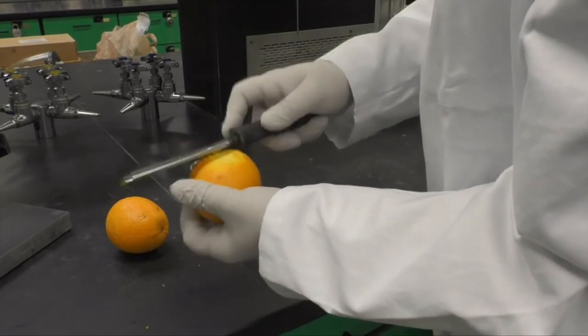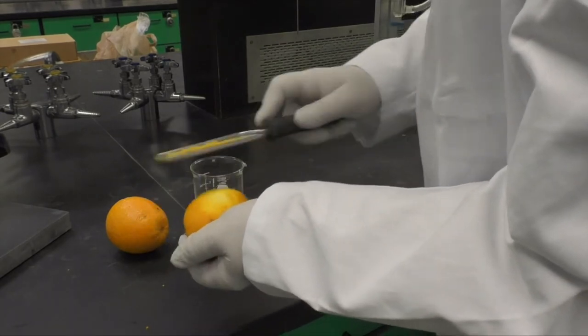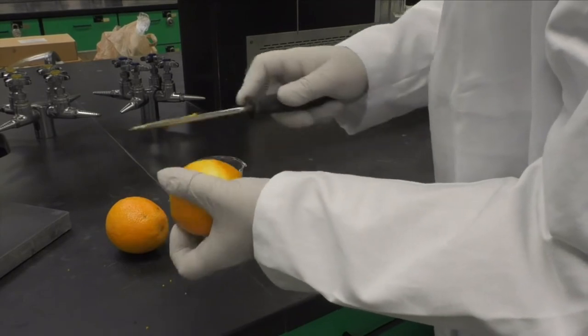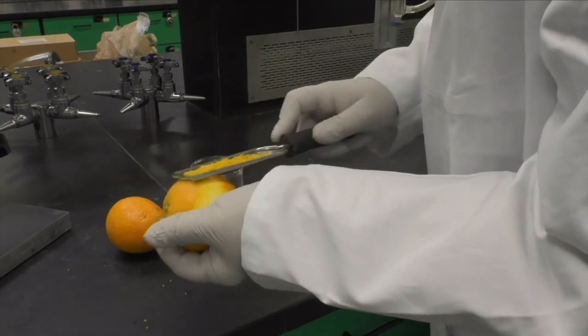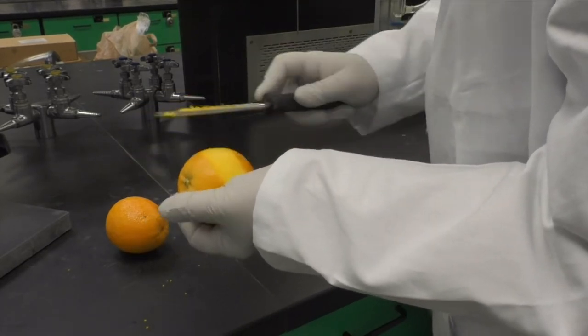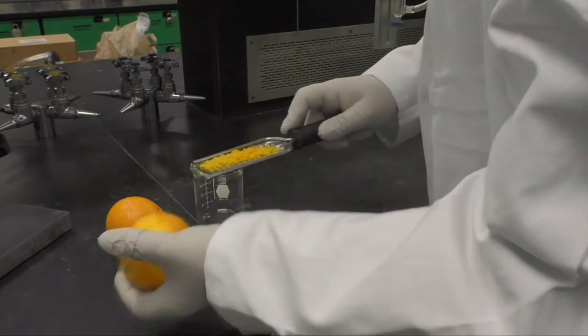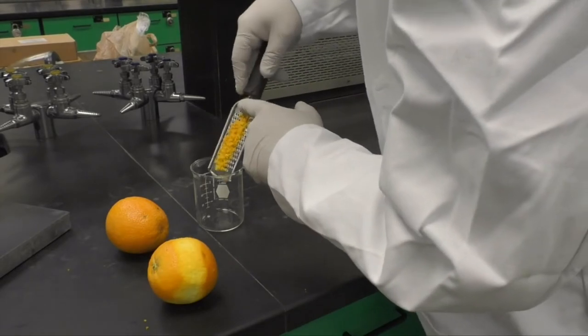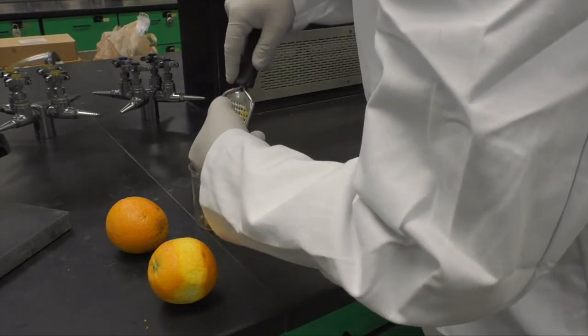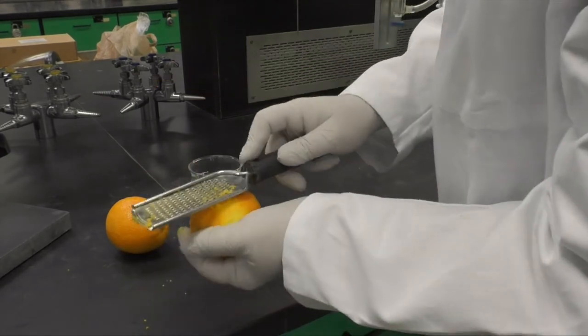Rub the zester across the orange so that just the colored part of the skin is removed. You'll need to constantly rotate the fruit. As the zest collects on the zester, occasionally wipe it from the zester into the beaker. Do not place it on a paper towel as that will soak up the oil that contains the limonene. Remove as much zest as you can.